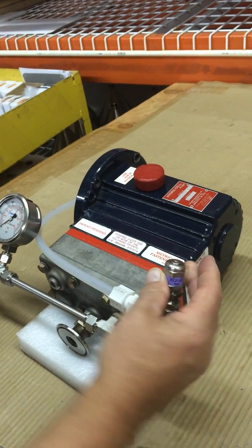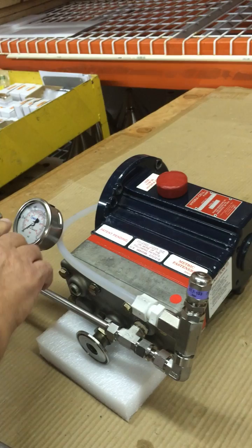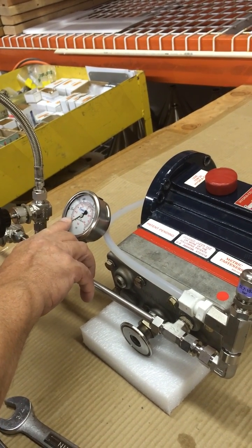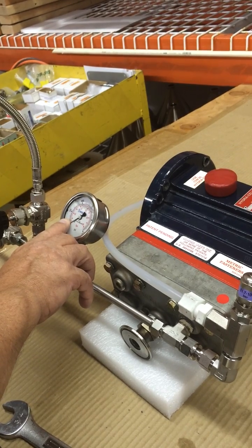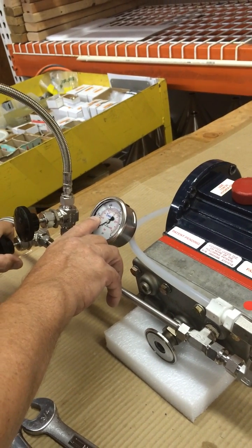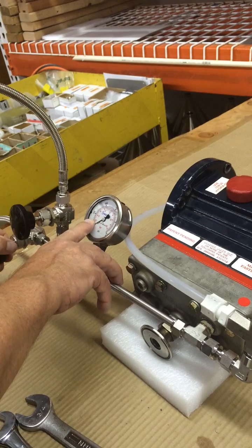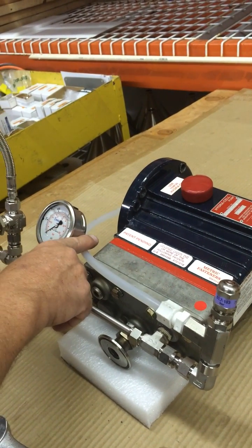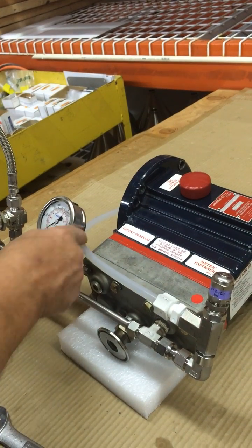If we turn this down, the pressure — it will allow the pressure to go up. So you can start turning it up; the pressure will go up to maybe 100 pounds, and then the relief valve will let the fluid bypass through here.